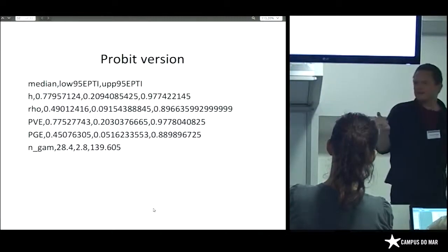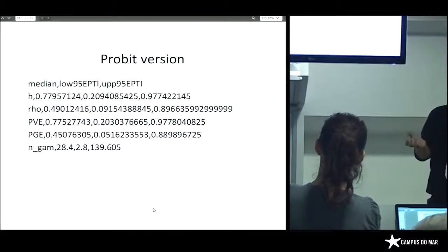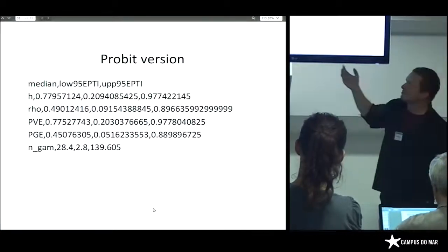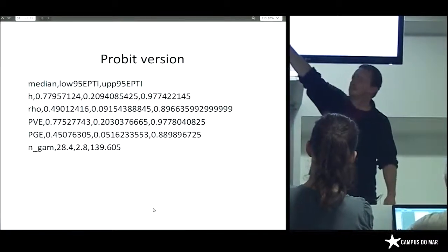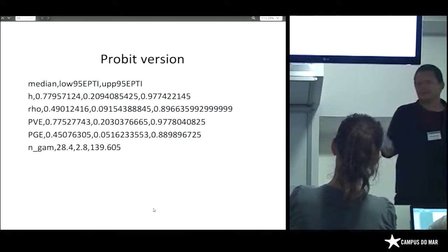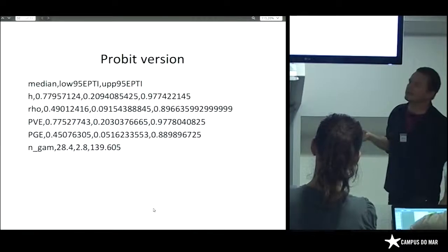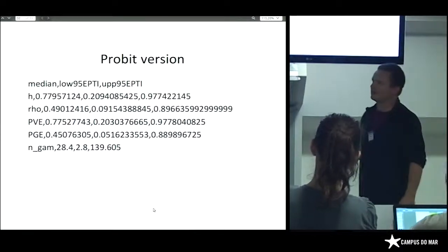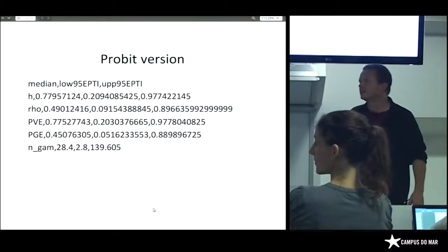So now we can explain about 30% of the phenotypic variation using some SNPs. But our estimate of how many SNPs we need is somewhere between 3 SNPs and 140 SNPs. So this is probably much closer to the truth in that we don't have an association with our phenotype with these data. What did we exactly change?